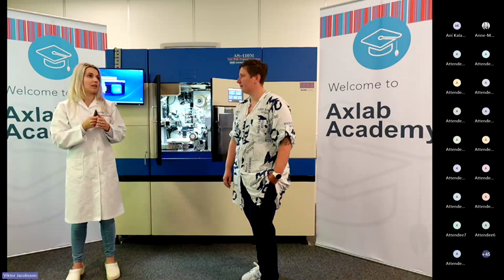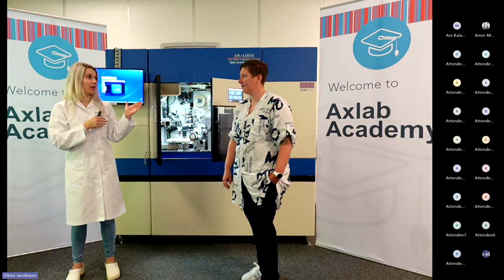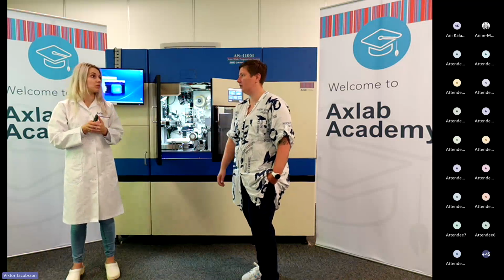But again, as we're talking, the levels and the sections are actually placed on individual slides. Yes. But what we're seeing more and more is the tendency that they can actually do fewer sections due to the quality. So we are seeing more protocols in Denmark where they're actually reducing the amount of sections. We have done that too, to get even more on it, because the quality is so good.